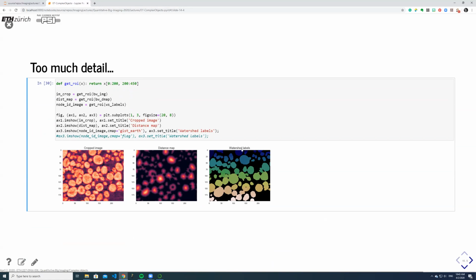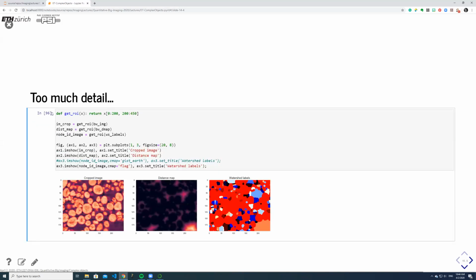And if we continue looking on the continuous color map, you barely see anything. You can see that it's gradually increasing here, but looking a little bit closer on, for example, this one, you can see that it is actually 3 different segments. So now we come into the choice of color map. So I changed to one called flag, and then all of a sudden you can see that it's a pretty crazy thing that we have segmented here.